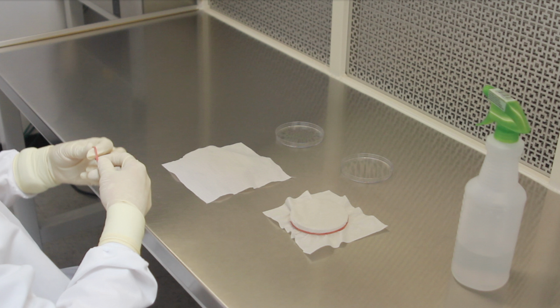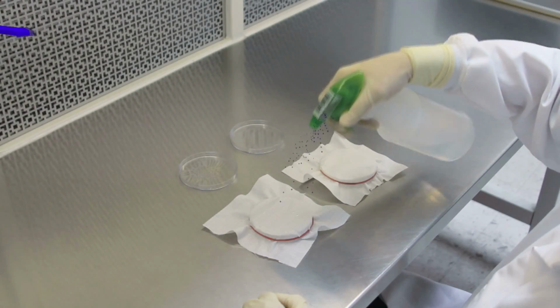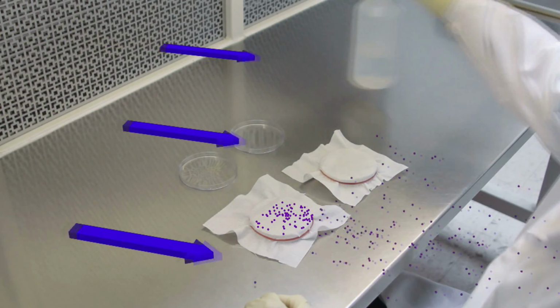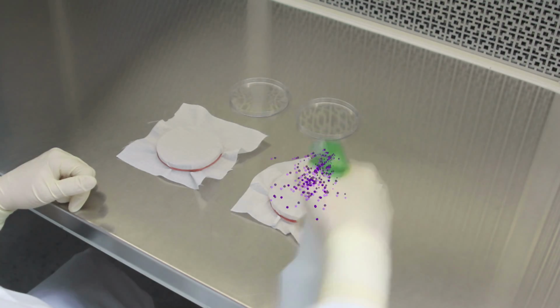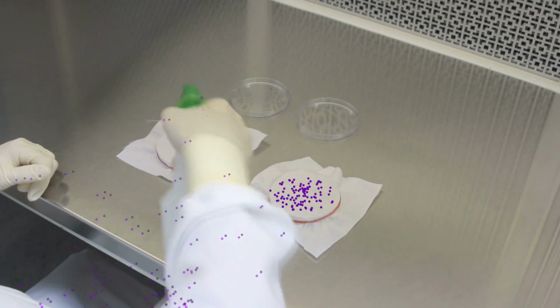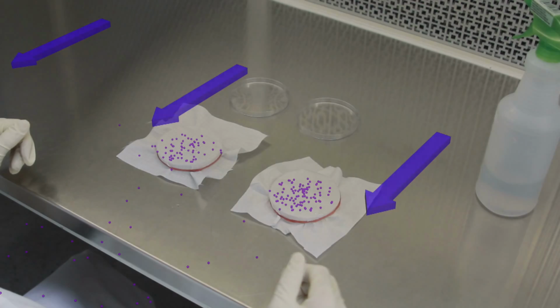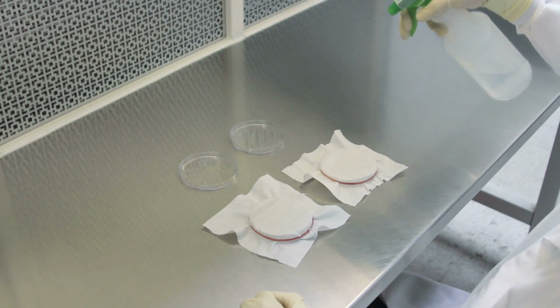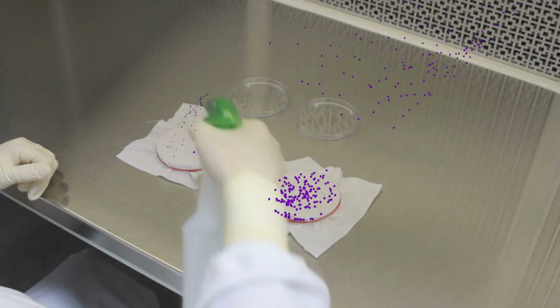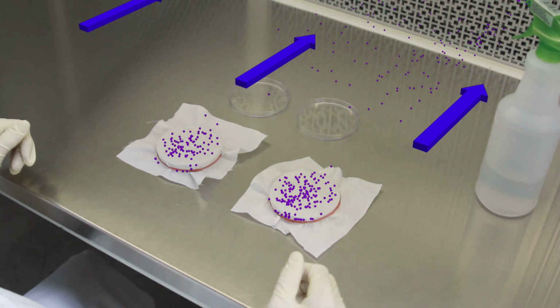First, the test is being performed in a horizontal laminar flow hood. If the hood is operating, the bacteria sprayed onto the fabric will be blown out of the hood and into the unprotected face of the technician. Much of the bacteria will blow away before even landing on the fabric. This would reduce the bacterial challenge to the fabric and artificially increase the BFE. If the hood is not operating, air currents from outside of the hood can blow the challenge bacteria away from the fabrics, thereby reducing the bacteria challenge and increasing the BFE.